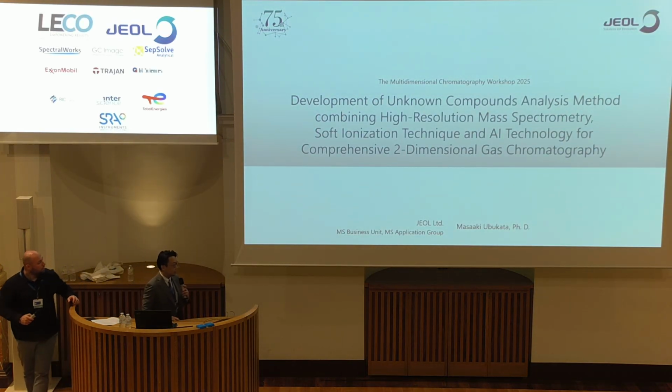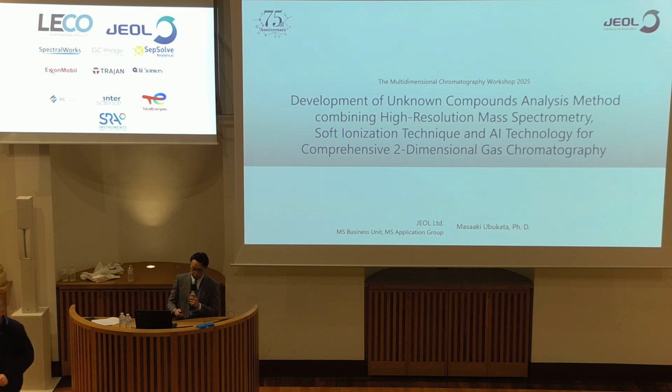Okay, and hello everyone. Thank you for giving me this opportunity. My name is Masaaki Ubukata, coming from JEOL, Tokyo, Japan. Today I will be talking about our unknown compounds analysis method using high resolution mass spectrometry and soft ionization techniques, and also the AI technology we are using in the software for GCxGC data.